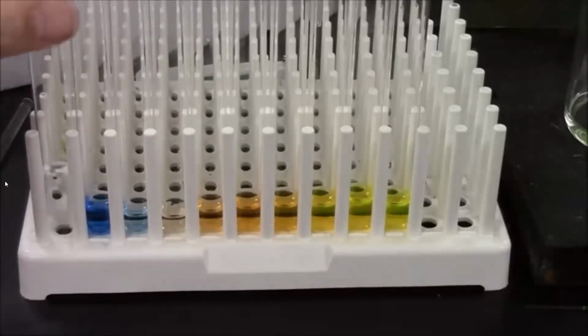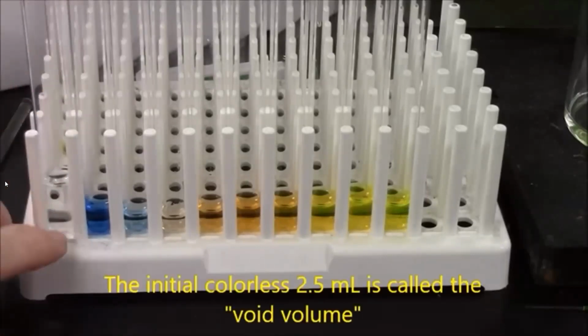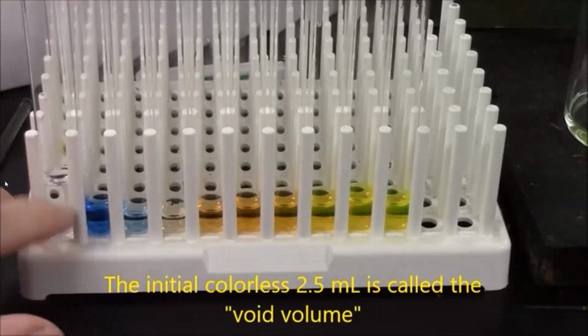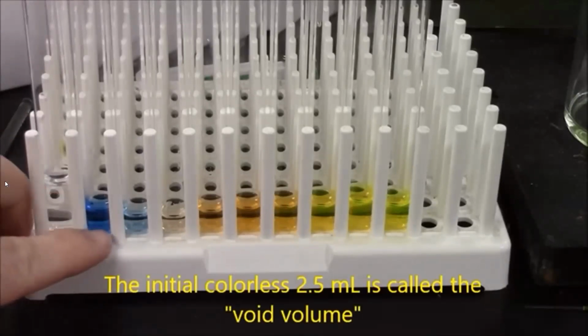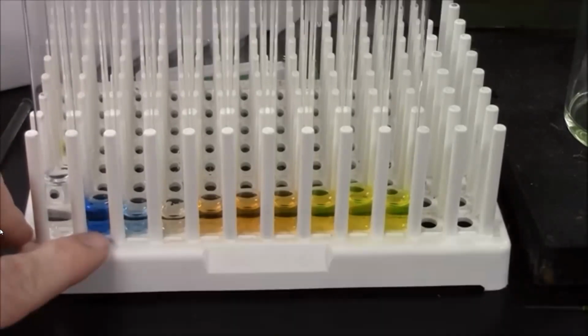Here's the fractionation. This first tube has nothing in it. So this volume, which looks to me about 2.5 milliliters, is called a void volume, where nothing comes out. But then the blue molecules, the blue dextran. So the first tube that he has shown is basically your mobile phase, which is actually colorless. So that is the void volume. Okay. Came through the column swiftly. So this is about a milliliter.